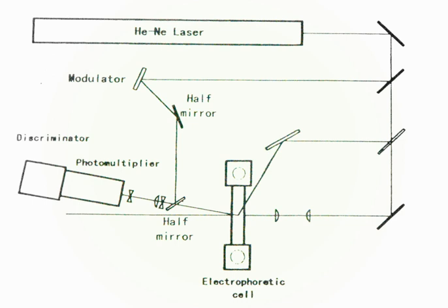Topic: Nanoparticles. ELS has been used to characterize the polydispersity, nanodispersity, and stability of single-walled carbon nanotubes in an aqueous environment with surfactants. The technique can be used in combination with dynamic light scattering to measure these properties of nanotubes in many different solvents.